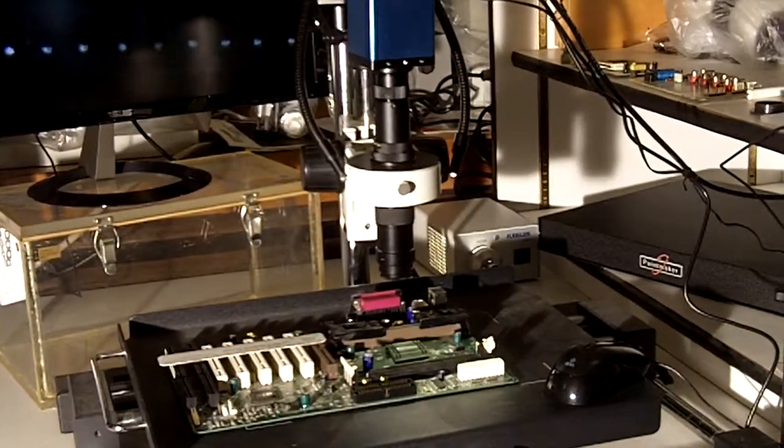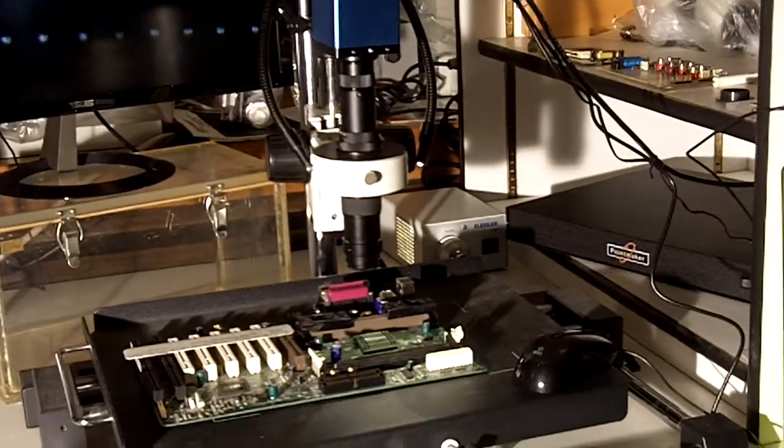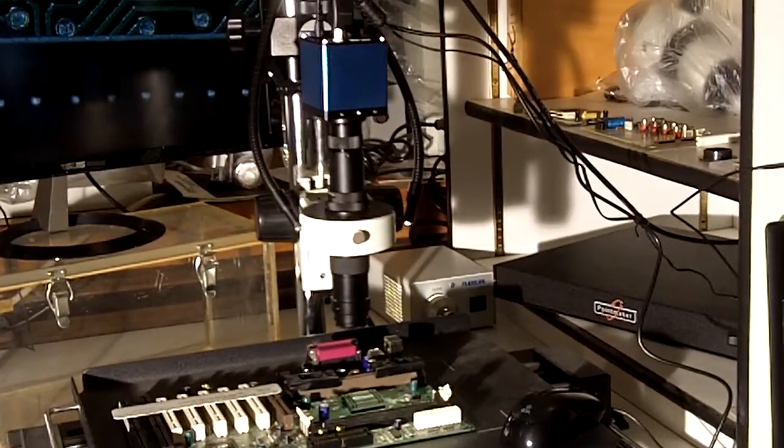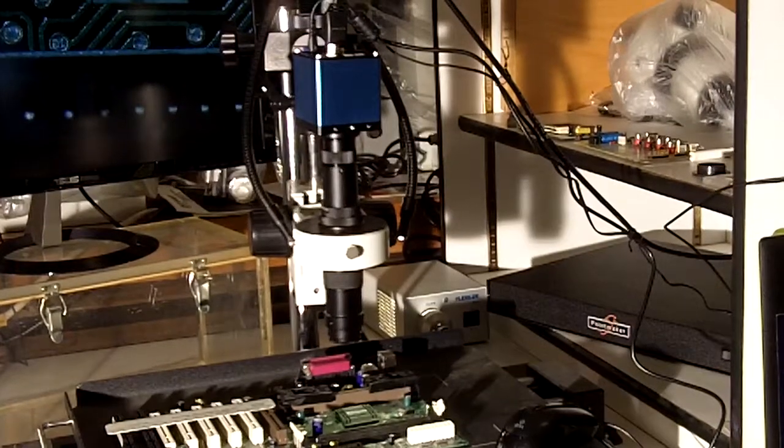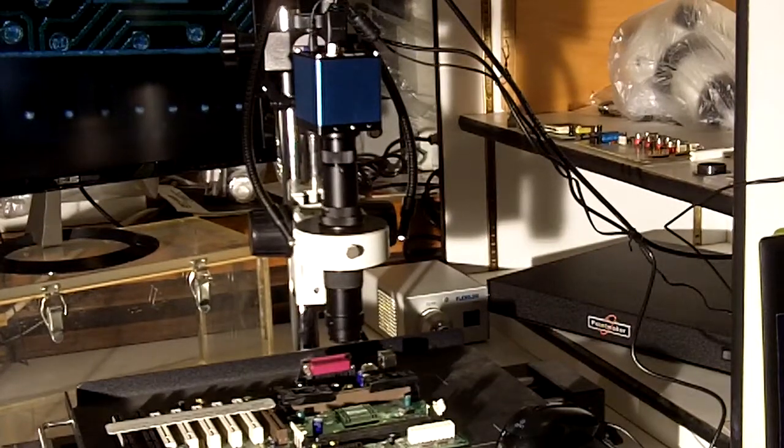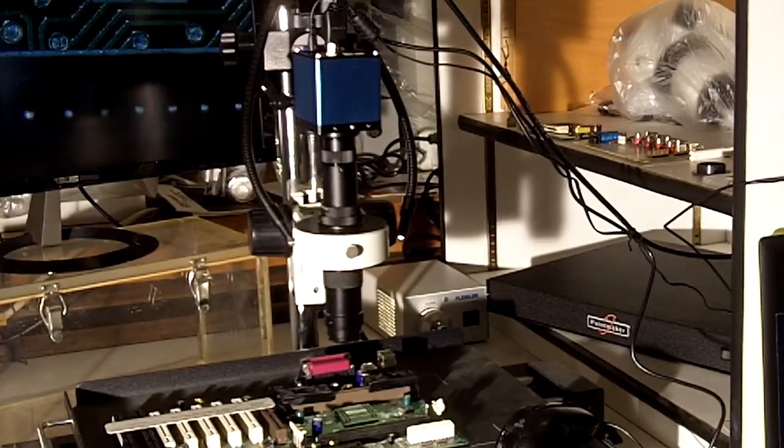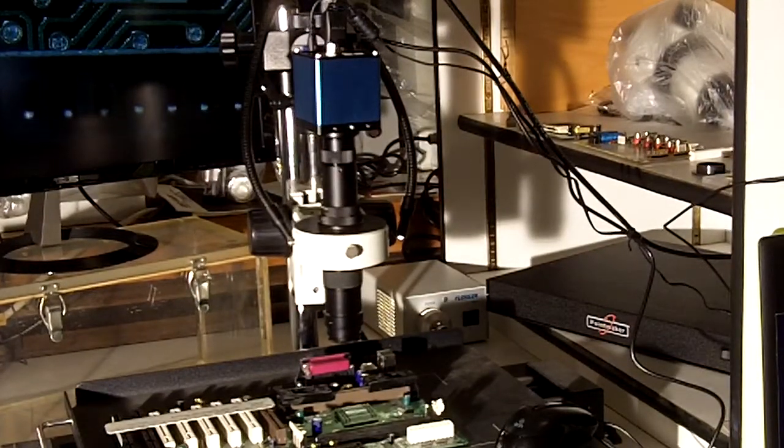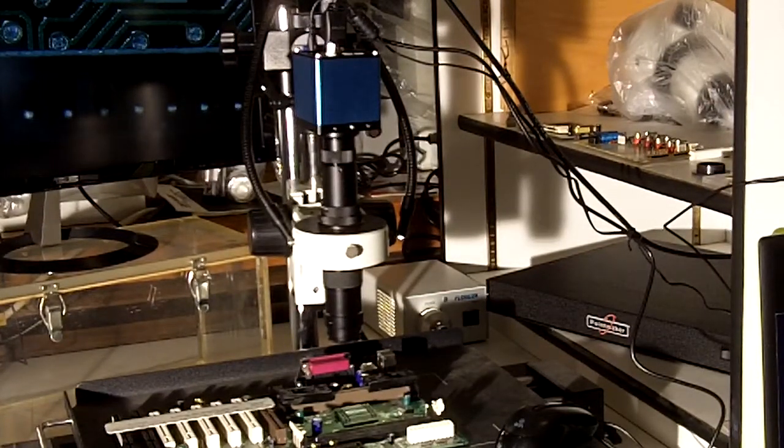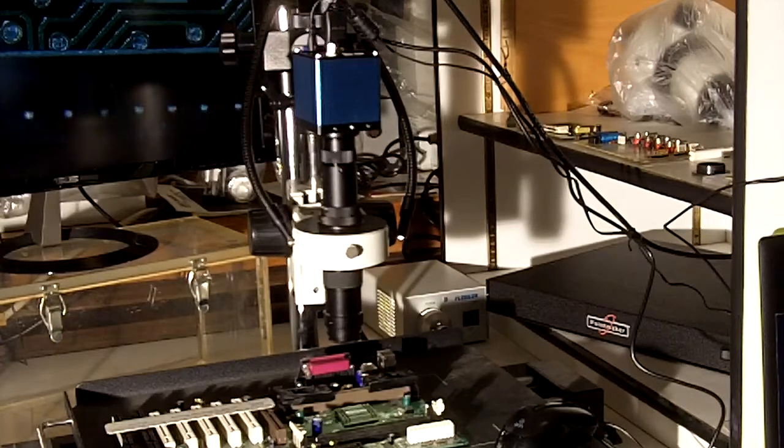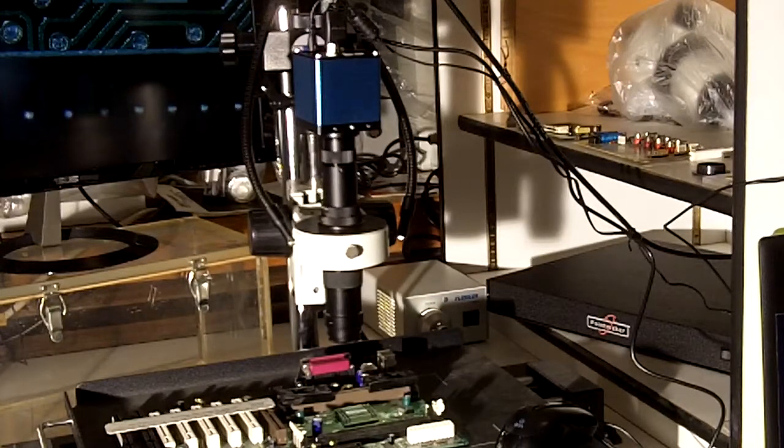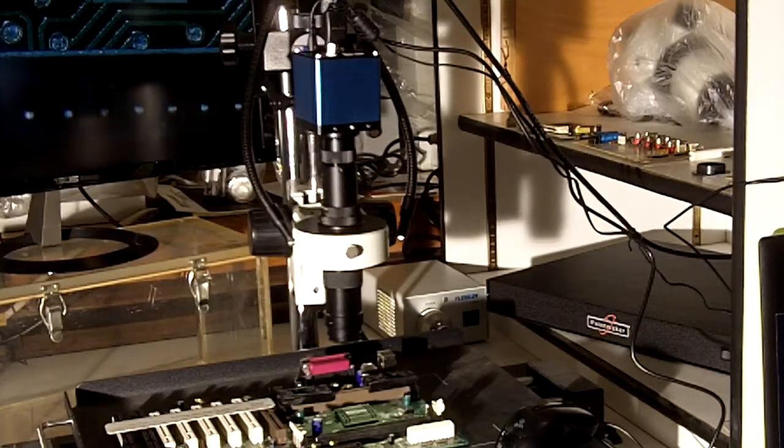But in this case let's keep it simple. We're just using an HD computer display, 24 inch, with this microscope and this camera. This is an interesting camera.